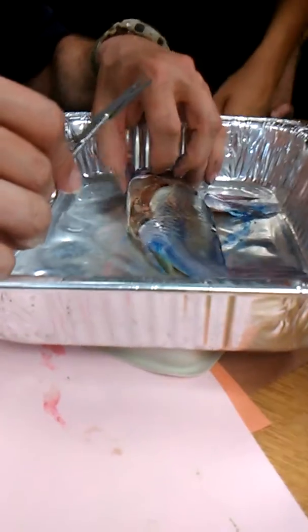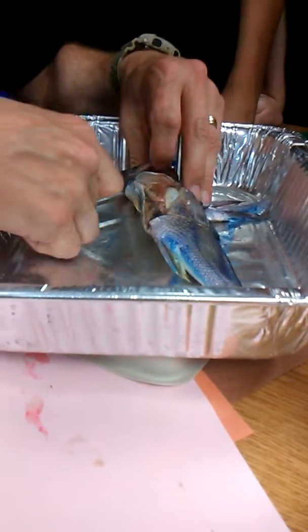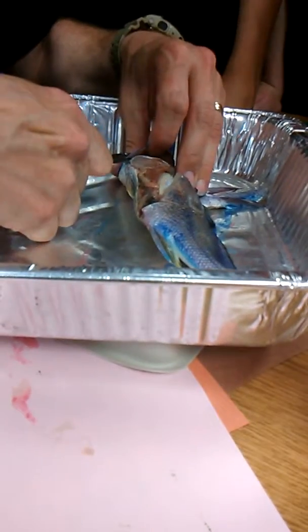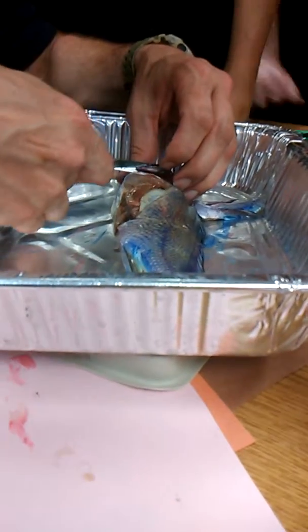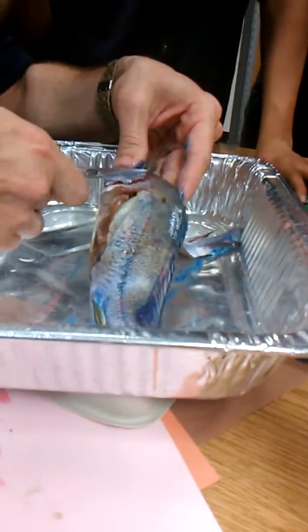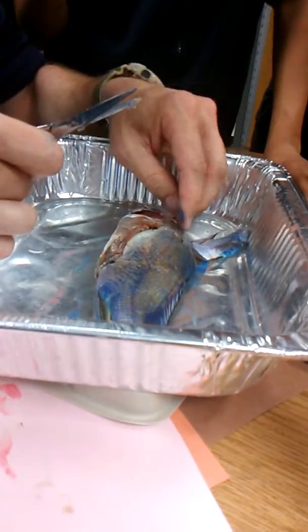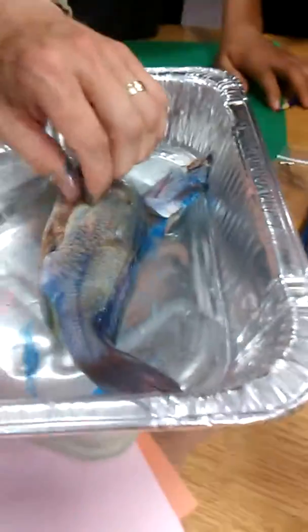Before we get too far into what's in the guts, I do want to cut off the gills — the gill cover — so you can see that gill a little bit better. The gill is where their gas exchange happens. They don't have lungs, but those gills are where the oxygen goes into their body and the carbon dioxide leaves the body. Your lungs are probably pretty pink like that right now.